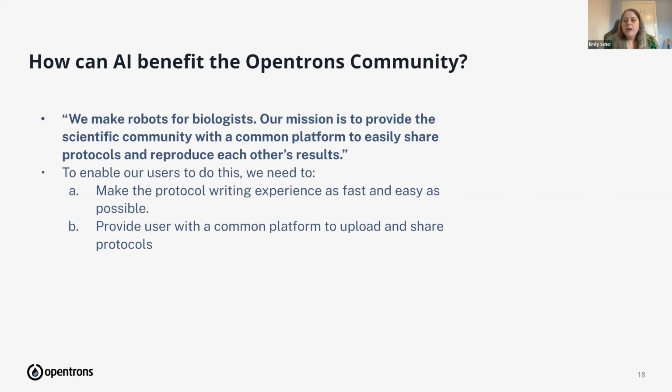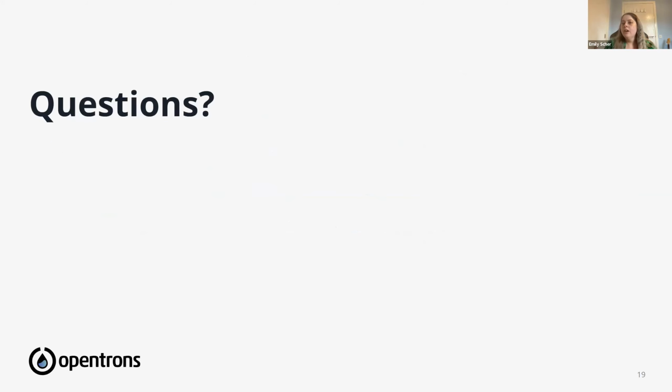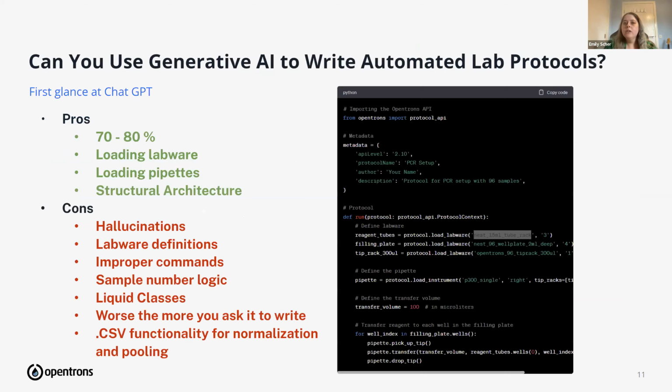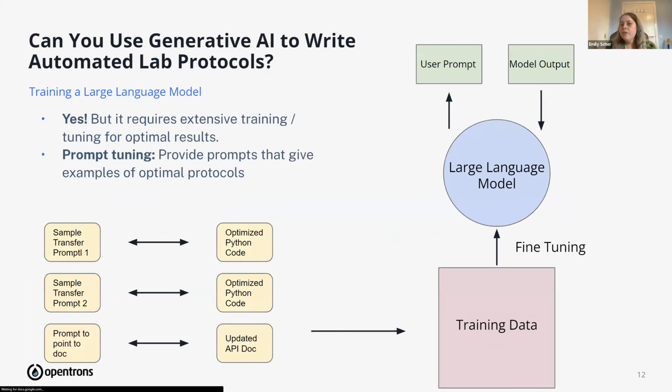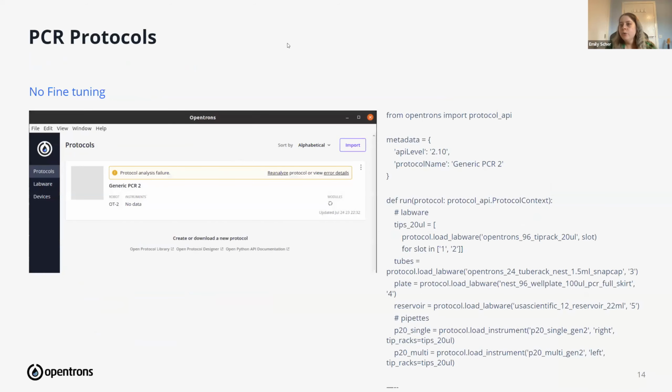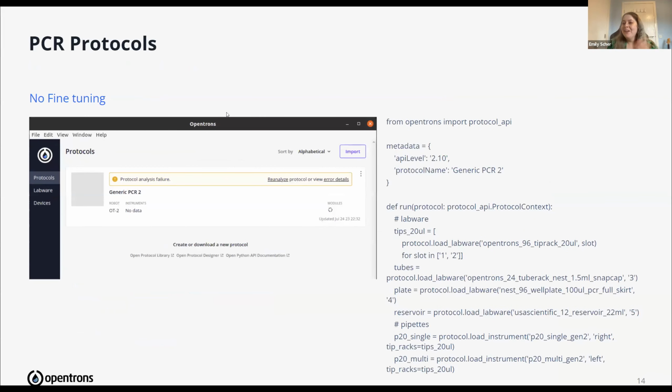Yeah, so it was based off of fine-tuning. So what Hamam showed was that originally ChatGPT without any fine-tuning still already had a good understanding of the underlying rules of the protocols that we build. But on top of that, we did additional fine-tuning, which then improved the model performance even more is what I meant.